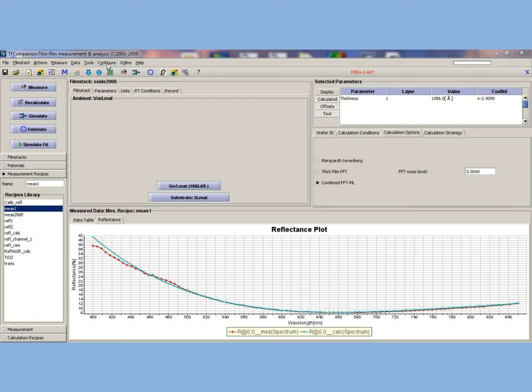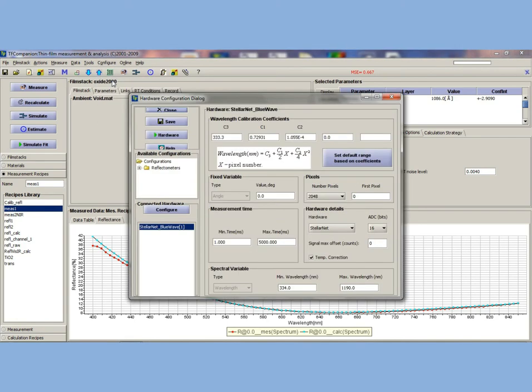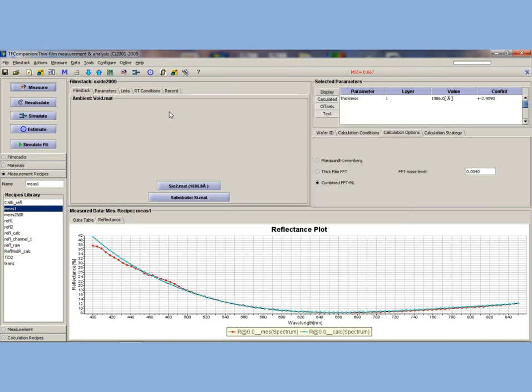Now let's double check our hardware settings by going to configure hardware. We see the three StellarNet calibration coefficients listed here. We can also set our number of pixels, digitizer settings, and start and end wavelength.